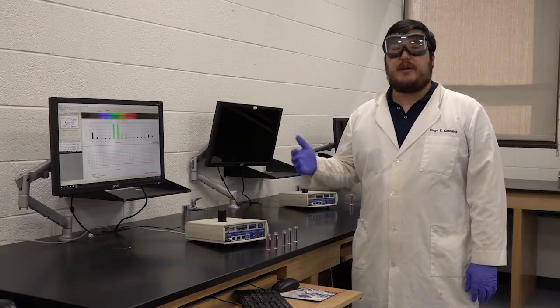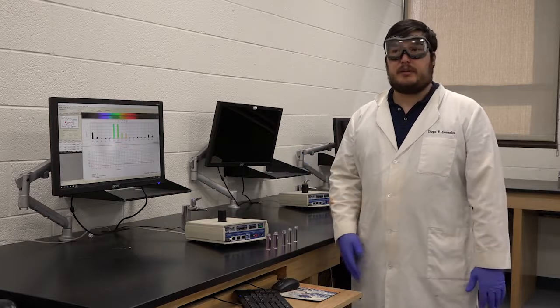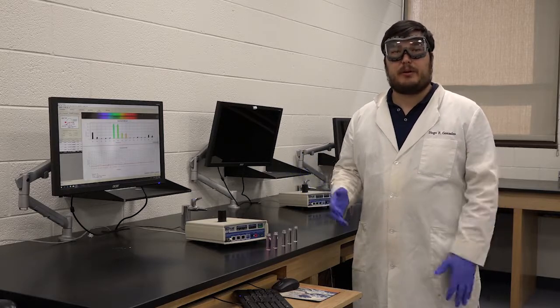As with anything in life, nothing is perfect, and sometimes things fail. Specifically, speaking for this experiment, sometimes the spectrophotometers may not be working properly or might not have been initialized properly. So if you see that your samples are not reading correctly, such as when you put the potassium permanganate solution in, you expected to see no absorbance of purple, but you did see absorbance, then go ahead and speak to your TA or your professor about this. They can help you troubleshoot your spectrophotometer and diagnose what the issue was whenever you perform the experiment.